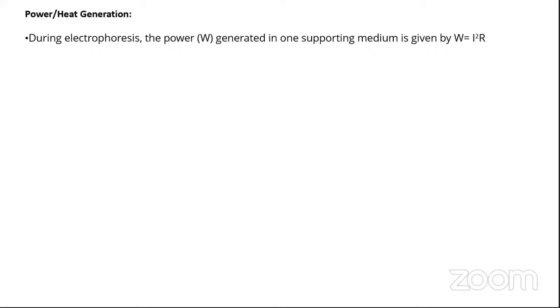Is it a fair question to ask whether we will get a better separation? Survey says yes. How many of you believe that you will get a better separation with increase in temperature, decrease in viscosity, and increase in electrophoretic mobility?